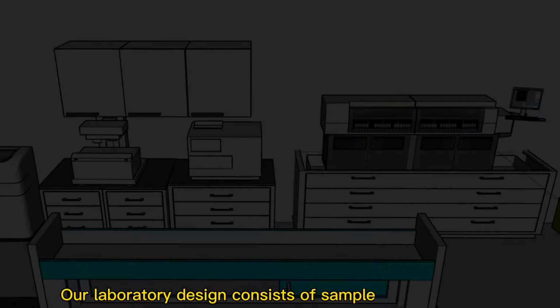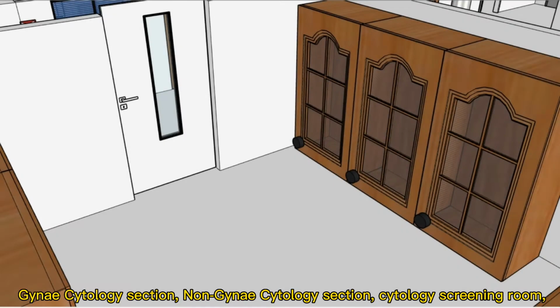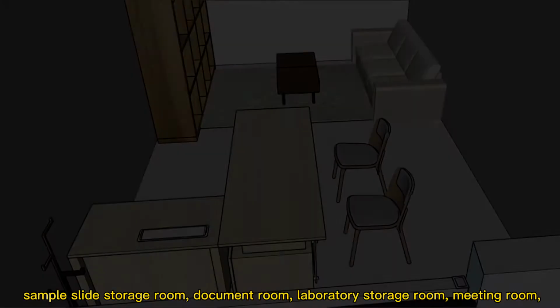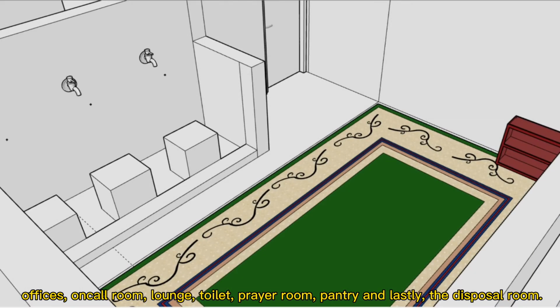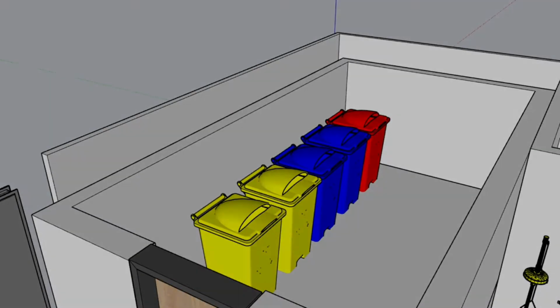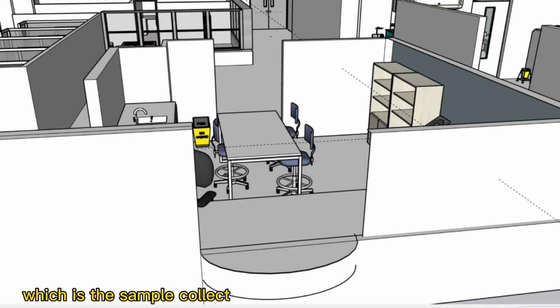Our laboratory design consists of sample collecting room, gyno cytology section, non-gyno cytology section, cytology screening room, sample slide storage room, document room, laboratory storage room, meeting room, office, on-call room, lounge, toilet, prayer room, pantry, and lastly, the disposal room.